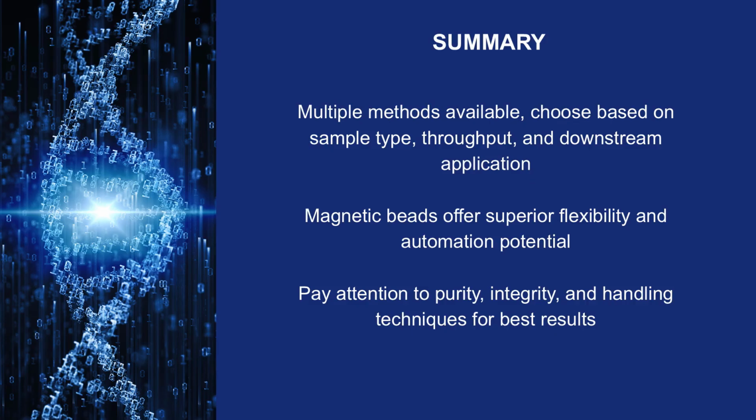To summarize, high-quality nucleic acid extraction is key to success in molecular biology. Method selection depends on sample type, throughput needs, and downstream applications. Magnetic bead-based methods offer superior flexibility, scalability, and purity. With proper technique, troubleshooting, and quality control, you can consistently obtain excellent results.